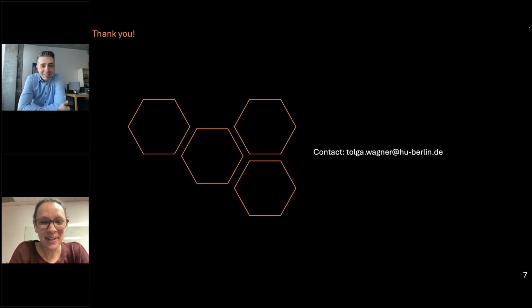Yeah. Two more questions so far. If anybody else has any questions, go ahead and submit them to the questions box. Have you combined your holography results with other techniques such as EELS or EDS or any other techniques? Yeah, EELS or EDS is what they have listed.